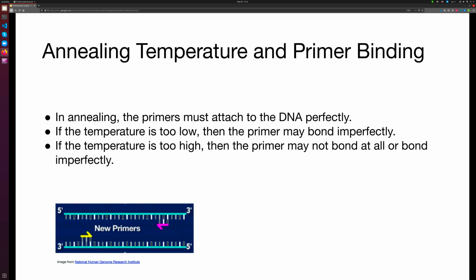So how can this be fixed? It can be fixed using so-called PCR master mixes. Not all of them, but some of them offer what is called a universal annealing feature, which has one annealing temperature for PCR reactions, and that's helpful. It offers another advantage, conducting multiple PCR reactions at once, because usually they have different annealing temperatures too.